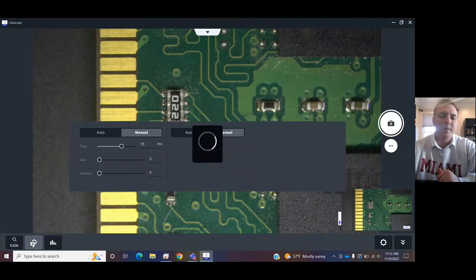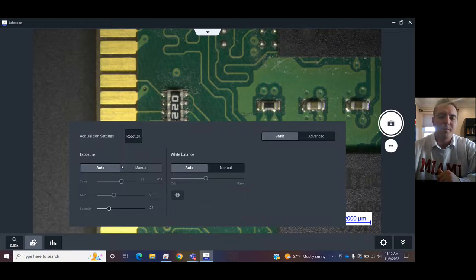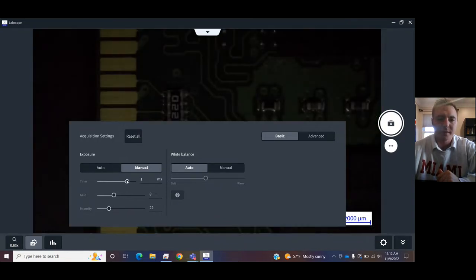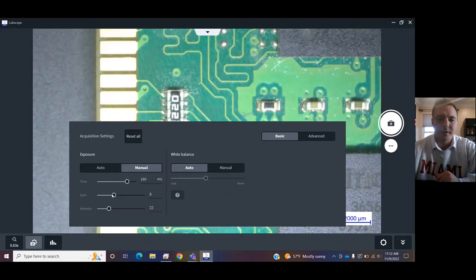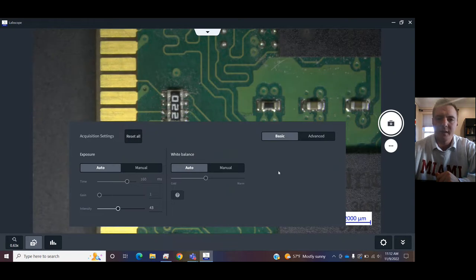In here, you can edit what you're doing. The camera settings, auto exposure, or manual. If you switch it to manual, you can choose the rate at which the camera refreshes. Make it darker, brighter. You can turn down the gain, change the relative intensity, and auto exposure.